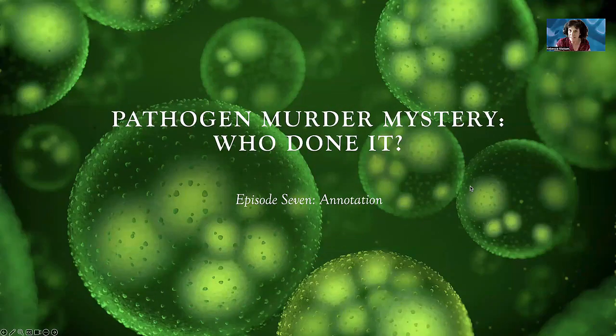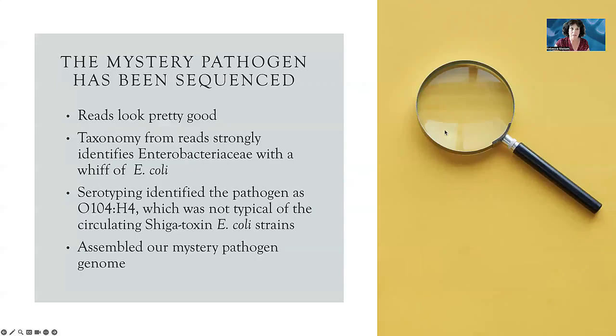Welcome back to the next in our pathogen murder mystery series. This episode is going to be about annotation. So let's just step through where we've gotten to so far. We sequenced the mystery pathogen that's spreading across Europe.